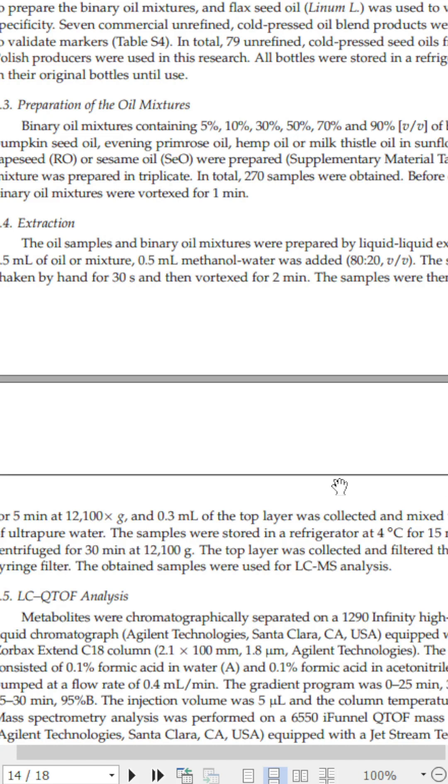15 minutes in the fridge and 30 minutes centrifuged, again at 12,000 Gs. And then the top layer was collected and filtered. I'm probably not going to filter it, but we'll see how clear the top layer is. That's a pretty straightforward protocol.